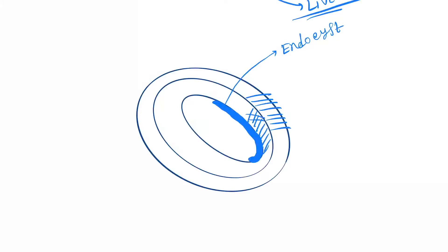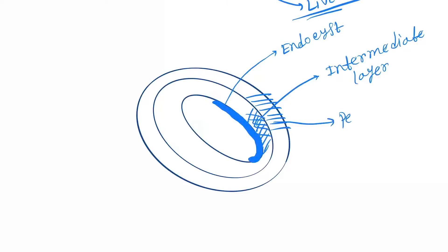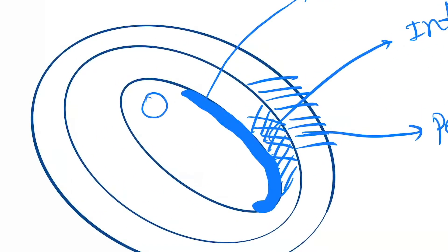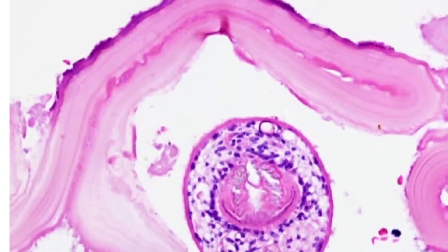Now let's label it. This inner layer is called the endocyst. This intermediate layer is called the intermediate layer. And this outer layer is called the pericyst. And inside this you will find daughter cysts.